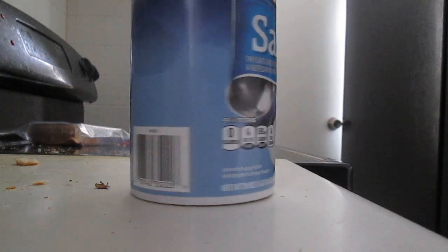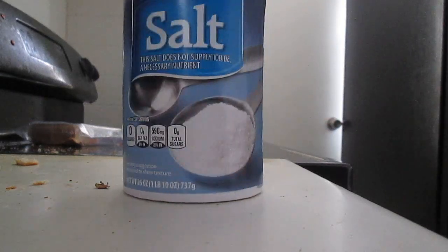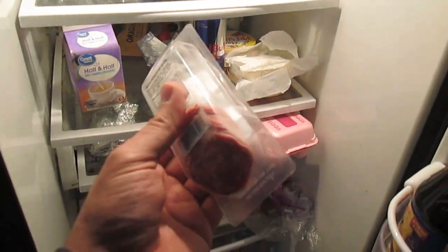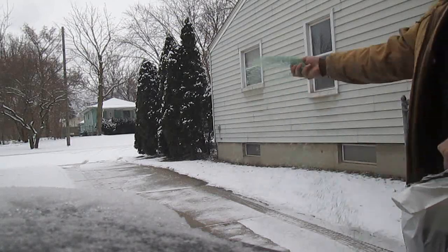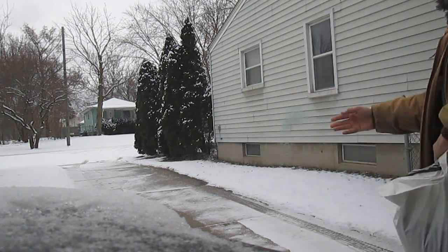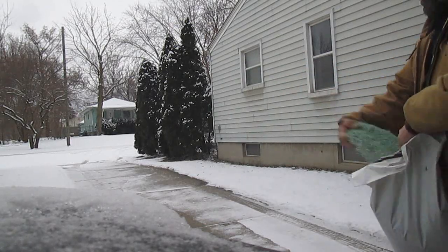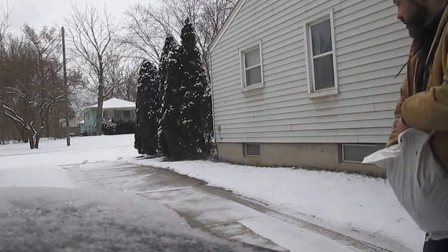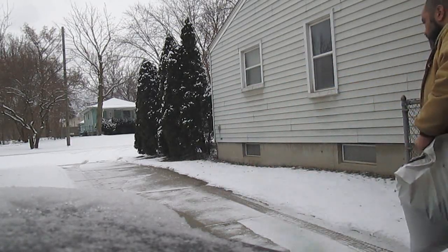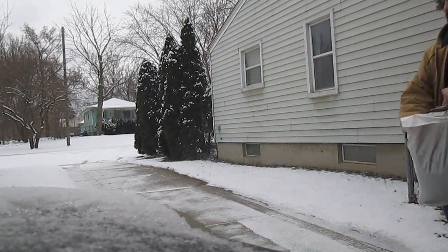Iodide in table salt, nitrite in processed foods such as salami, bromide and sulfate in different kinds of rock salt, and more mildly interesting analyses.